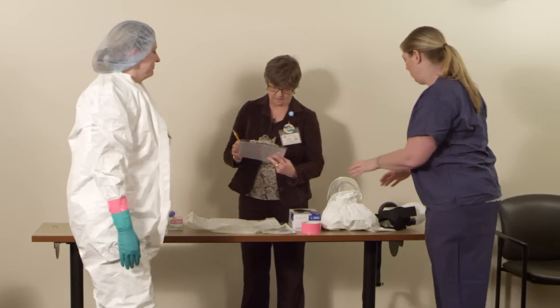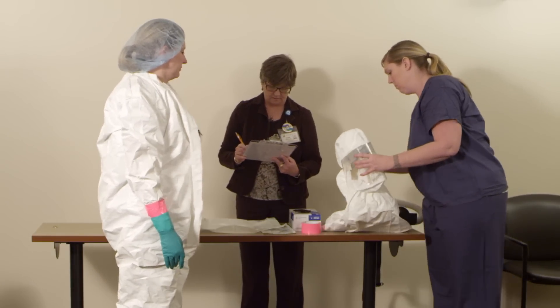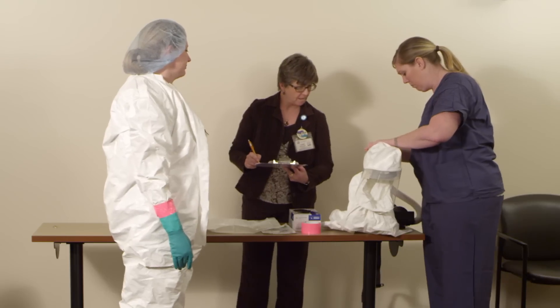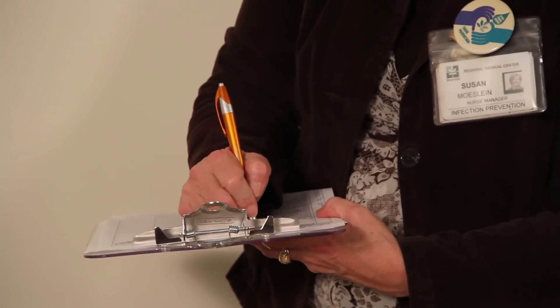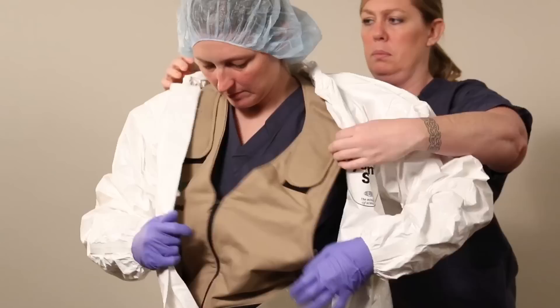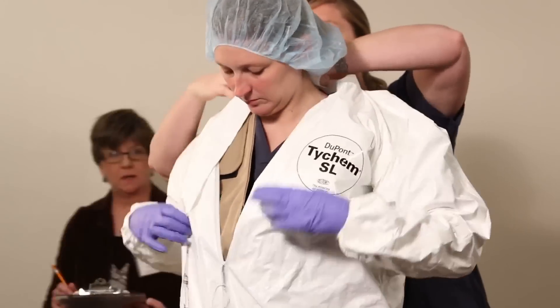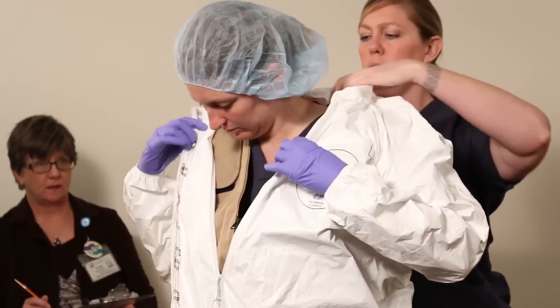A safety officer will always be present to ensure you are donning and doffing safely, as well as observe your interactions with the patient at all times while you are providing care. Remember that a donning buddy will also be present in case you need assistance with putting on your personal protective equipment.